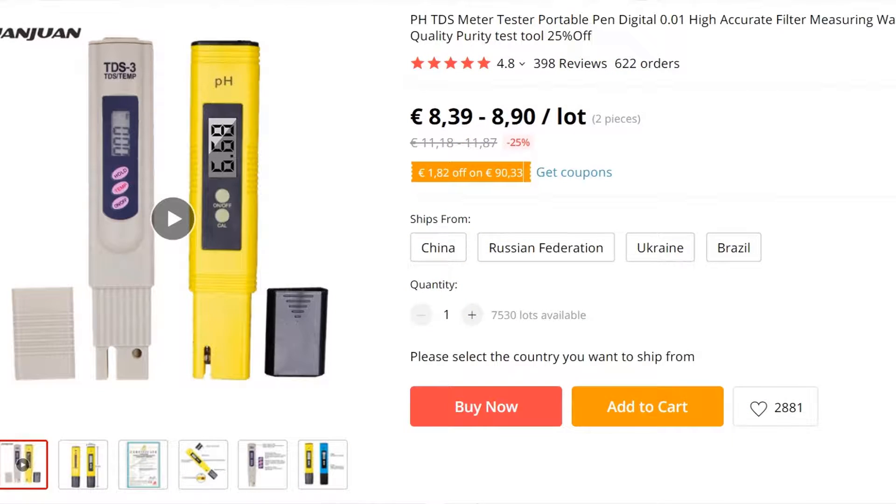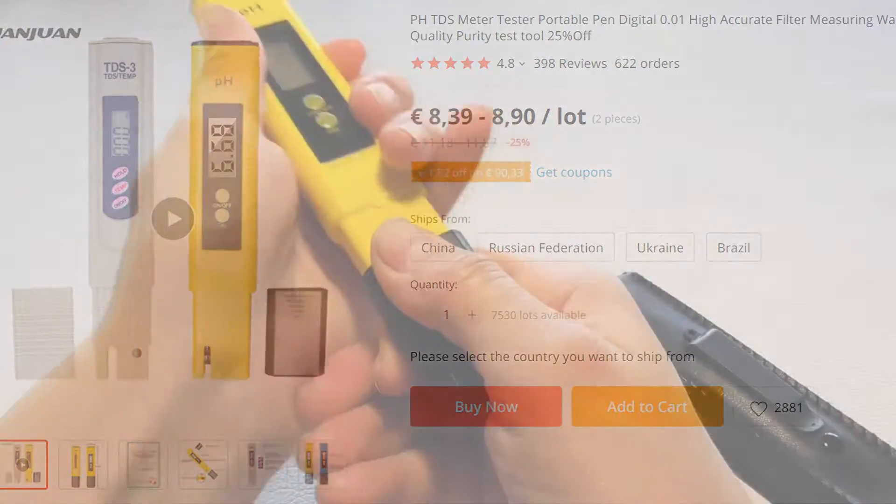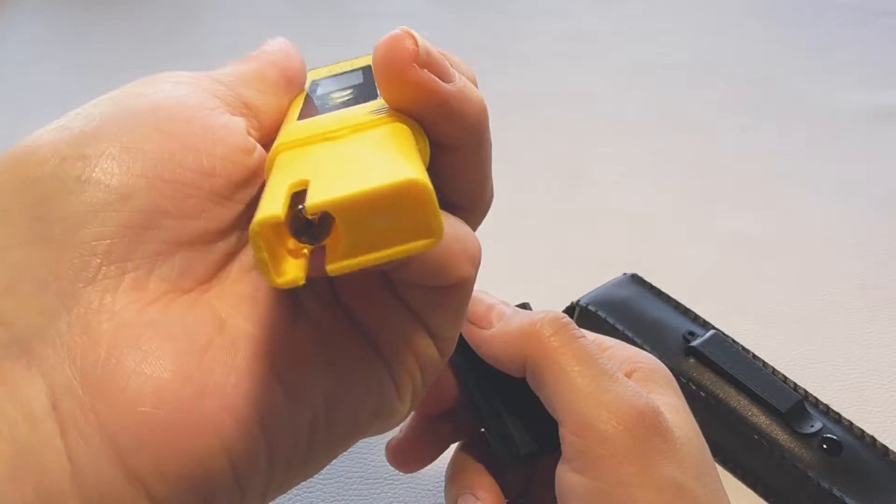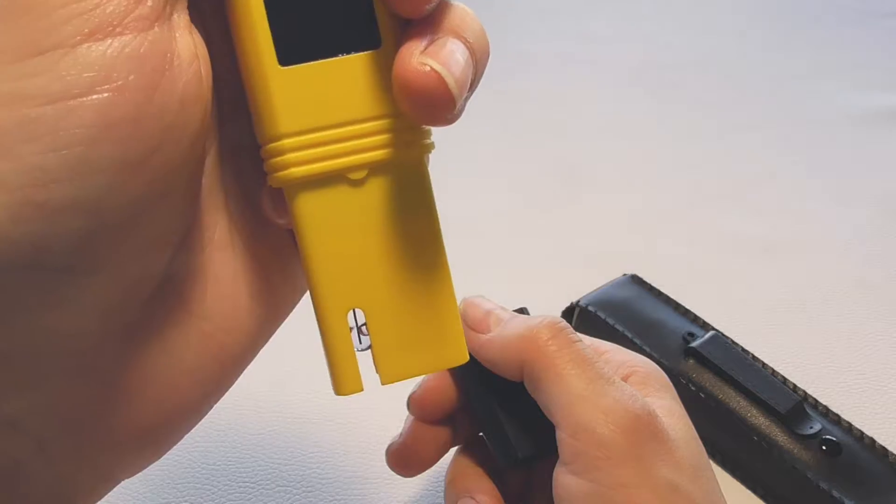Fast and accurate results. No need to work with those annoying color charts and test strips. Pocket fitting pH meter that is also lightweight and compact. Total concealed fit in your bag or pocket for easy casual carrying.